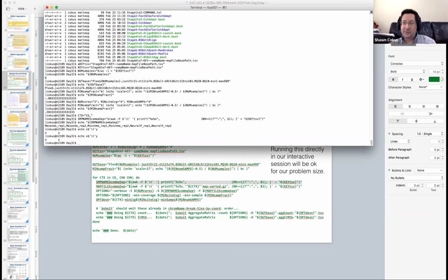That $quote activates a really unusual form of quoting in bash, and the \t inside that kind of quoting means tab. That's how you sneak a tab into an actual command line argument when you can't even type them, because it's taken over by tab completion. So the -F tells awk to change your field separator, bash turns that into a tab, and then awk just gets an actual tab. That's how that business works.